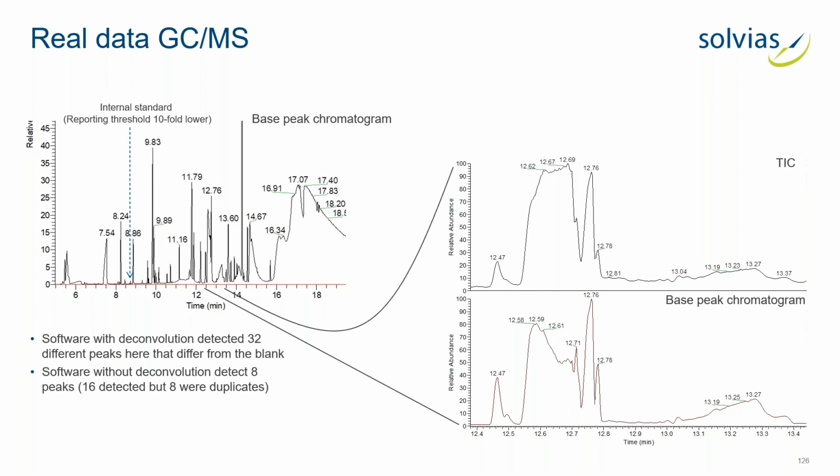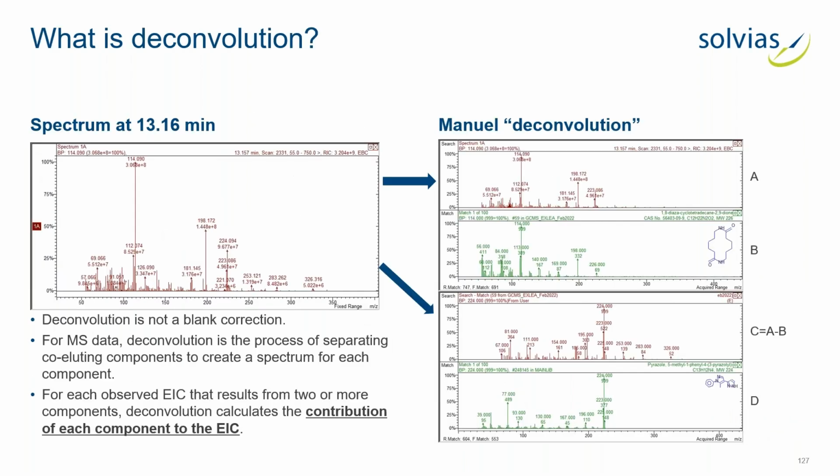And when you look, for example, at the chromatogram, you might see 8 peaks, but more or less there's a hill and another hill on it, and it's quite complicated to identify these kinds of things. But with the data deconvolution, we can do it. So the question is, I say a lot, what is data deconvolution? It's not something that is so well known maybe to most of the audience.